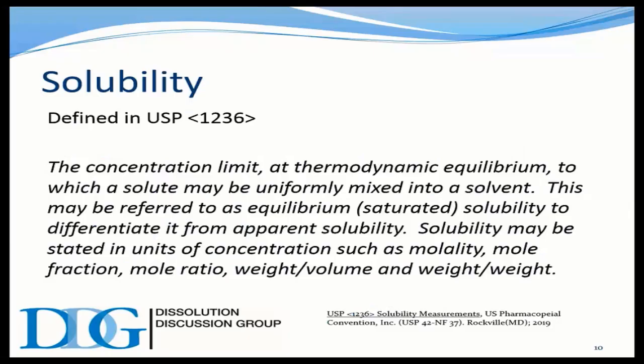So solubility is mentioned in the new chapter. Not just mentioned, it is the title of a new chapter, 1236. And what this chapter is really focusing on is the thermodynamic equilibrium. That is saturation. That's where a solute is uniformly mixed into a solvent, and it is at a state of equilibrium, which is equivalent to it being saturated. So whenever we say thermodynamic equilibrium or saturated, those are basically the same.